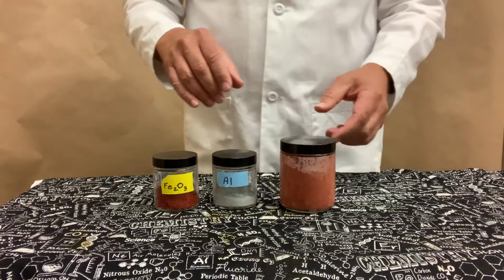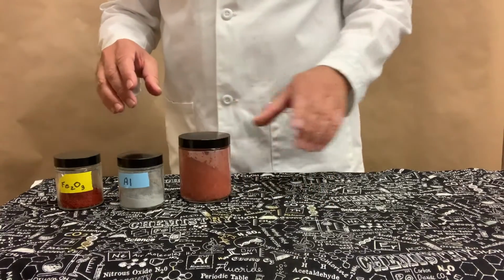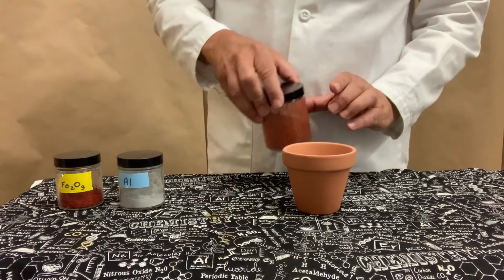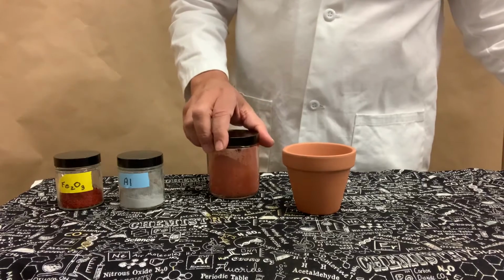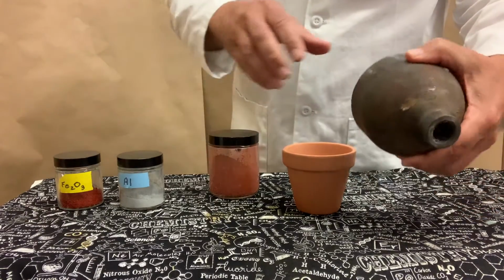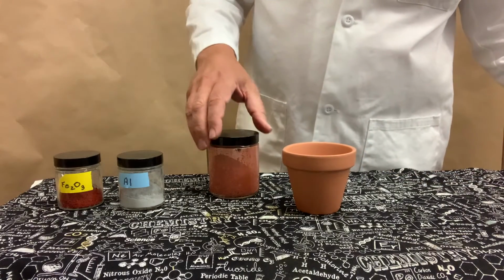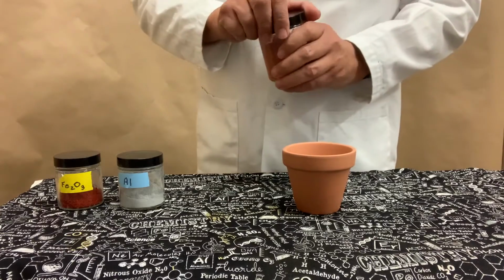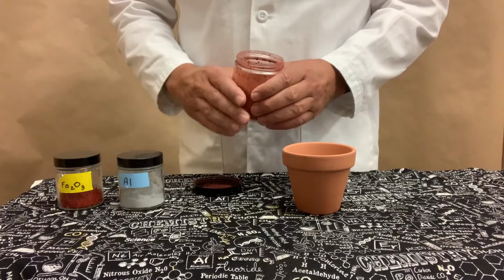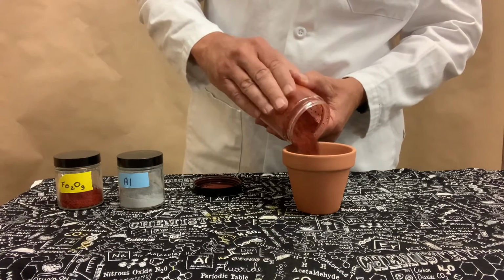It's a very exothermic reaction, so in order to contain it, I'll be doing it in a flower pot, and I'll be putting that flower pot into a secondary container, this steel container, when I perform the reaction. I'll start by putting some thermite mixture into the flower pot.